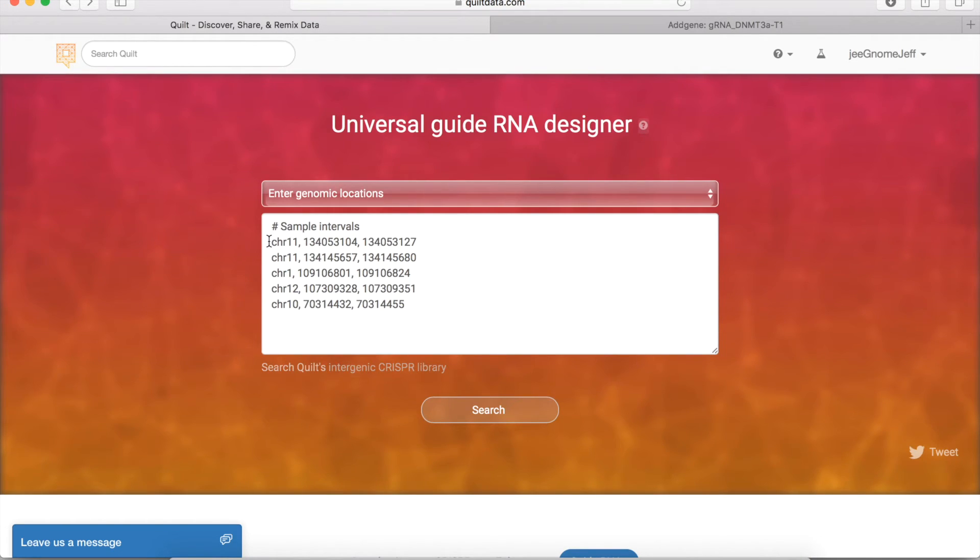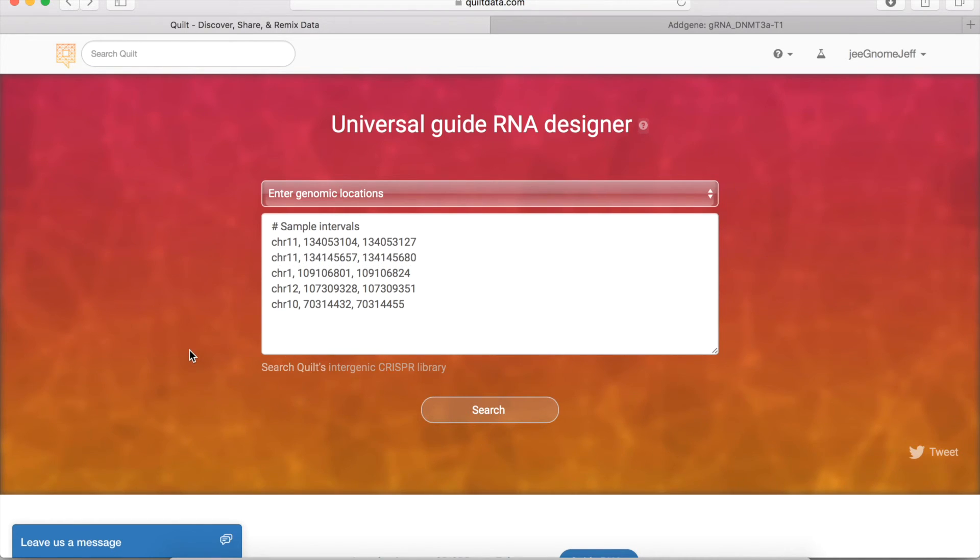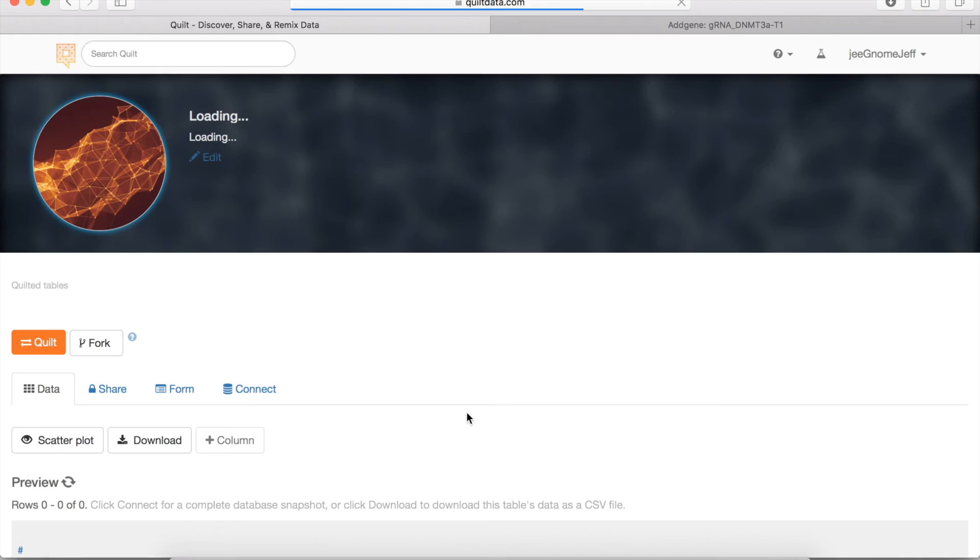But what you can do is search by entering genomic intervals and we'll search for all the guide RNAs that fall within that region. And again, you can input these and just hit the search button.